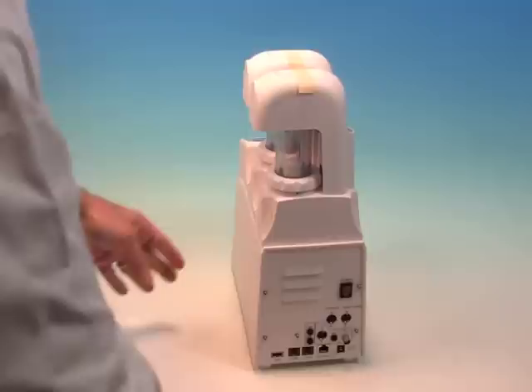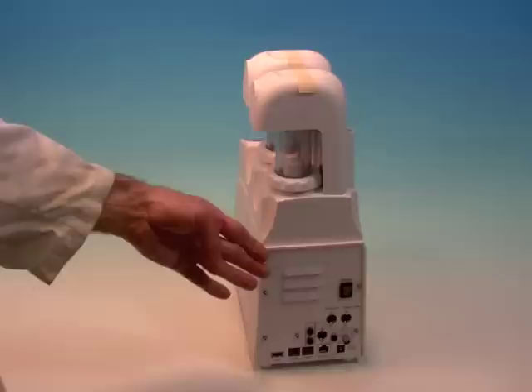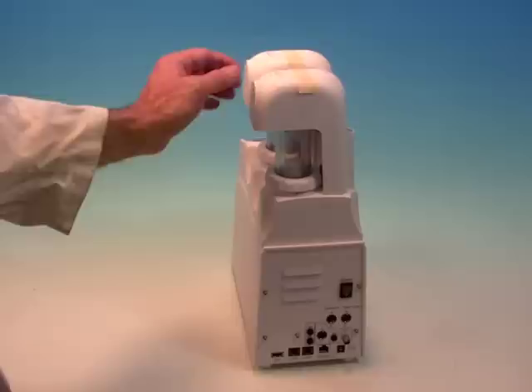A unique feature of the AT700 titrator is that the preamp comes pre-installed in the main unit itself. This allows the titrator to have a more compact footprint.